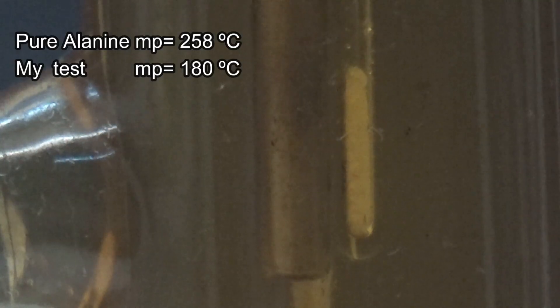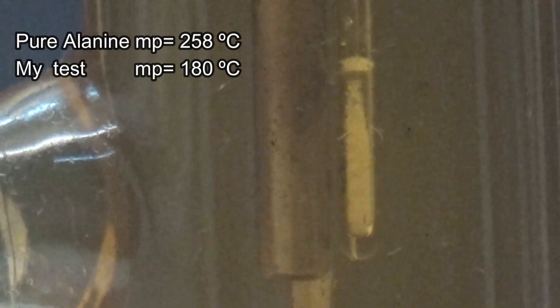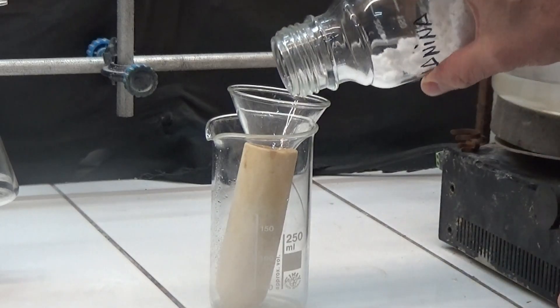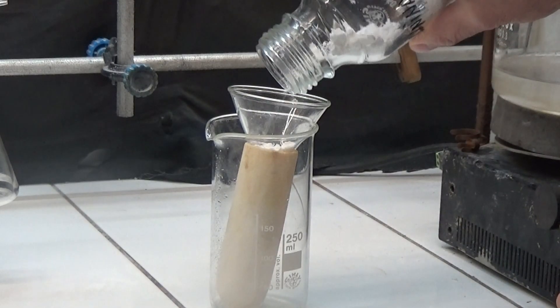The melting point of pure alanine is 258 degrees. In my test it gave a very low result, 180 degrees. This indicates that the alanine obtained is quite impure and must be purified.